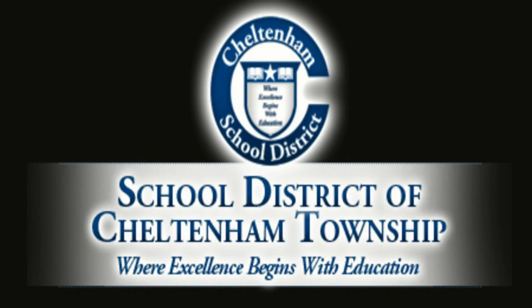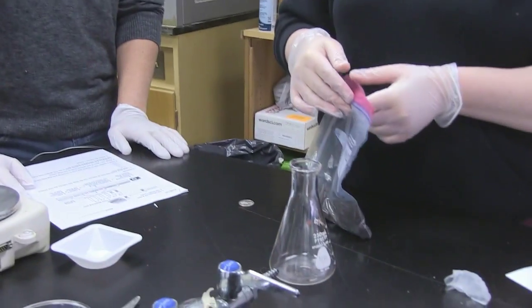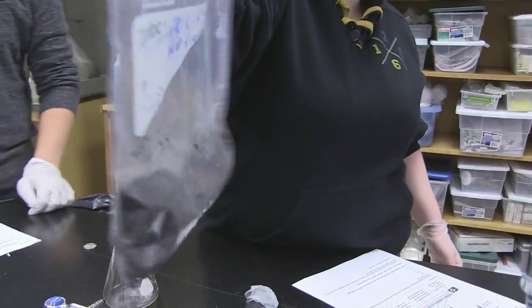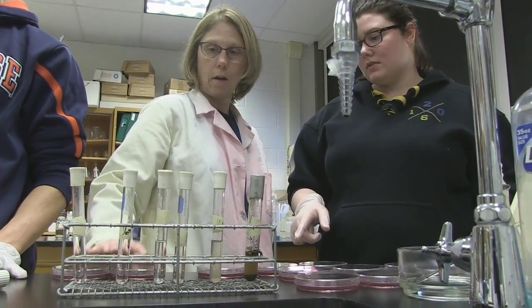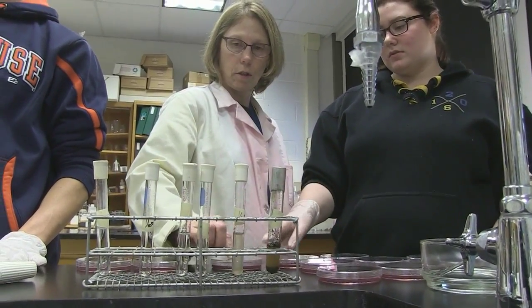Cheltenham High School boasts an incredible microbiology program. Students are afforded the opportunity to learn about bacteria in a hands-on laboratory setting. We were given the opportunity to sit in on one of Ms. Sheridan's microbiology classes to see exactly what they were up to.